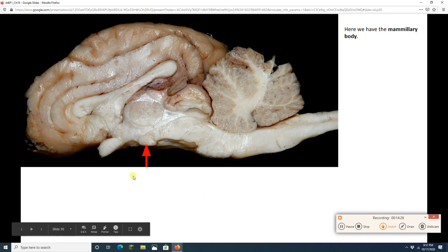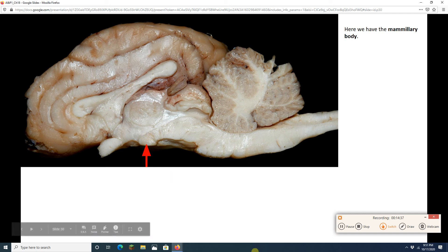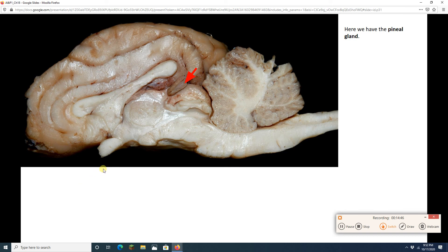Once I found the interthalamic adhesion, I went straight down and found my mammillary body — very important for smell. Remember, sheep have one; you and I have two. Then I got back on my diagonal line. There's the pineal gland right there, also called the pineal body. It is going to make melatonin, which is that hormone that is essential for good sleeping. So we had a diagonal line with four structures, taking a little detour to hit that mammillary body.